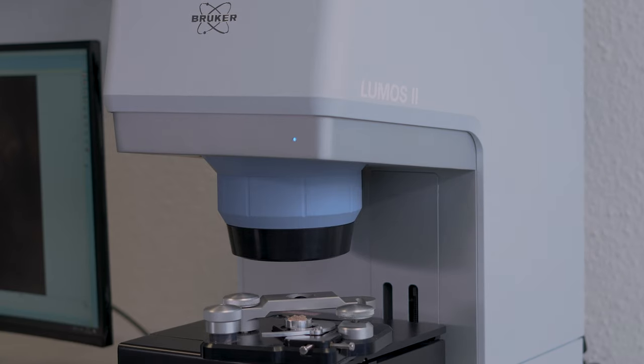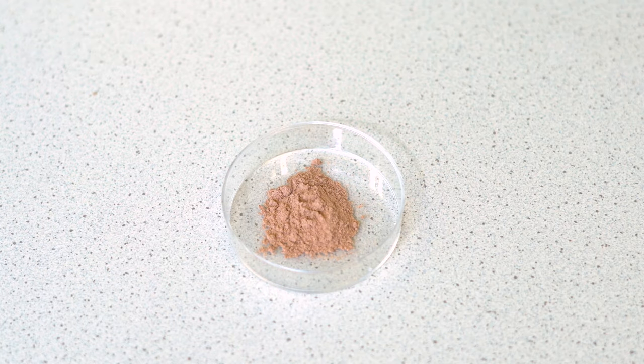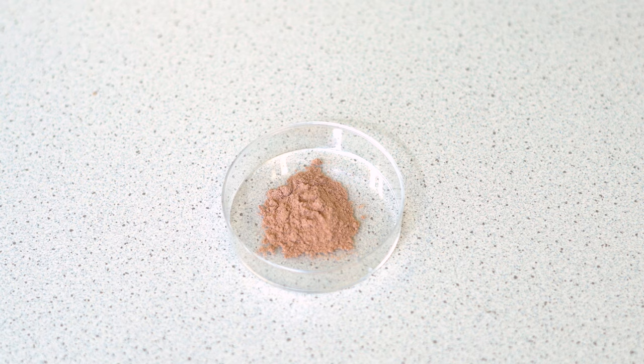Let's do the same and check the ingredients of this powdered hot chocolate mix using ATR imaging.